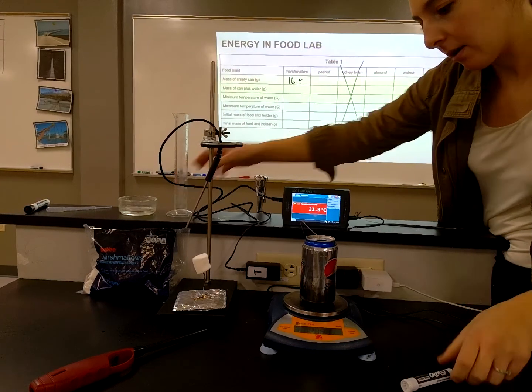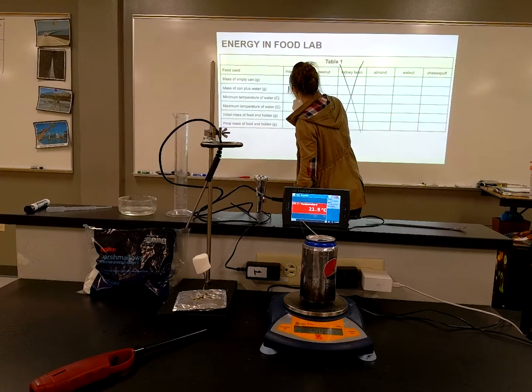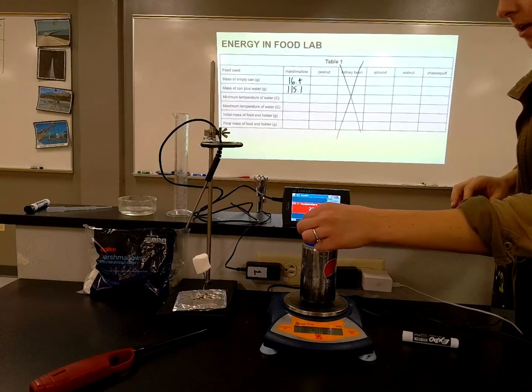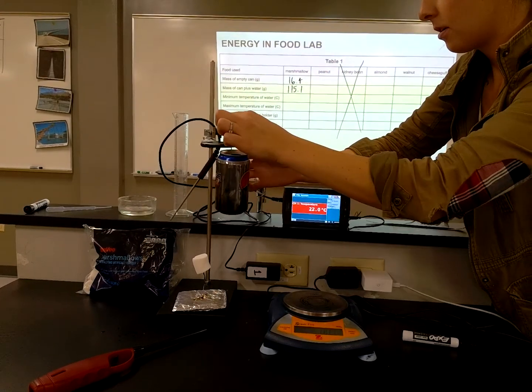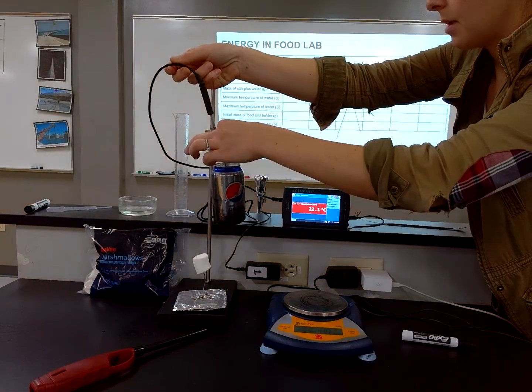So let's see how I did. 115.1. So not exactly 100 milliliters, but pretty close. All right, and we're going to hang this on the ring holder.